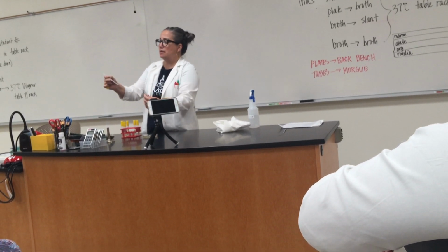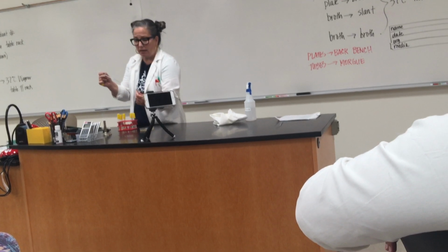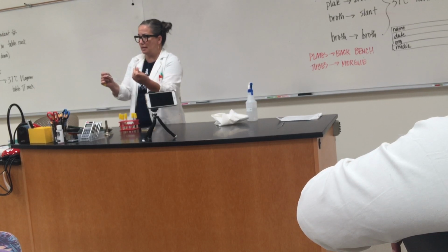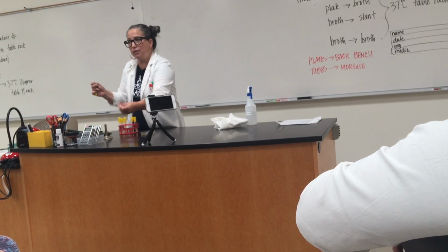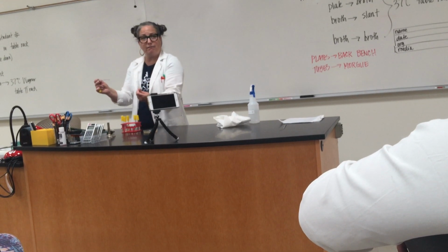So I sterilize, I open, and as soon as I open my tube, which I have not done because I'm talking to you, I wave this through the flame. I'm not trying to sterilize this, I'm trying to create hot air again. When I wave that through, it creates a movement of air out of the tube so that stuff from the air can't fall in it.